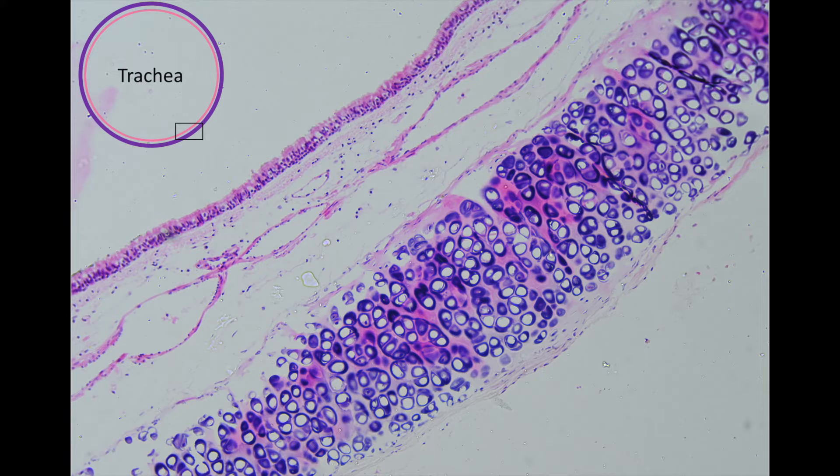The black box on the drawing shows the small section of the trachea that is actually in the micrograph. The inner lining of the trachea is the epithelium — the air we inhale and exhale is directly contained by the epithelium. The purple section that looks like a cobblestone road is cartilage. If you feel your trachea, you will feel horizontal ridges — that is the cartilage that prevents the trachea from collapsing on itself when we inhale. That's pretty cool.